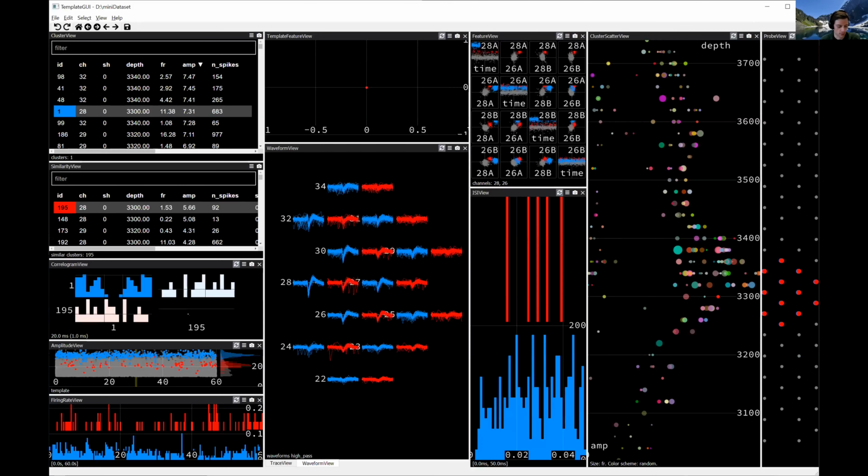The other one is CW. So I can do colon CW, and then say 200 milliseconds, and I zoom way out on the Correlogram view. Okay, so there's a whole bunch of different aliases, and once you get fast at things and you're finding yourself clicking through the same menu option over and over again, you can look for the alias and you might be able to speed up your workflow.